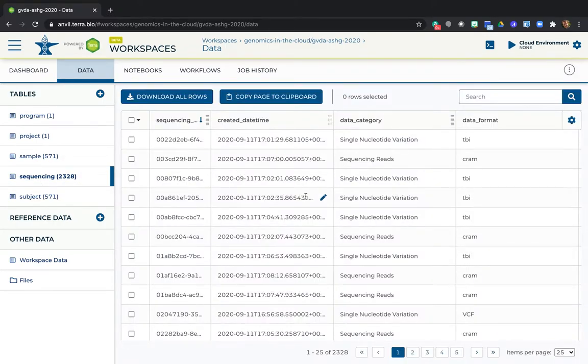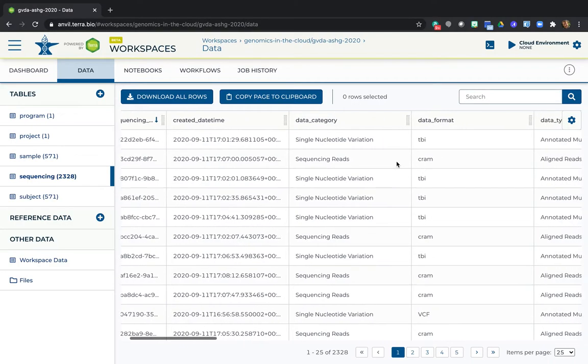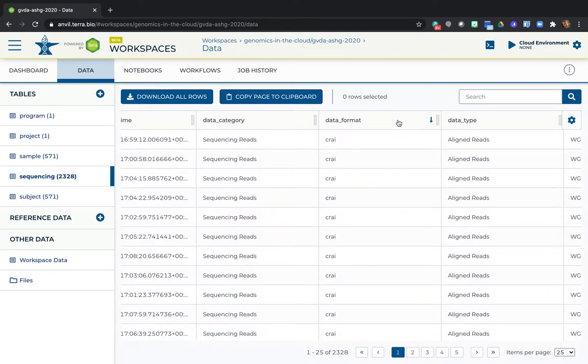The data that you imported includes the sequencing reads in CRAM format, as well as GVCFs for each sample. And here, I'm reordering the table to find rows that say VCF.